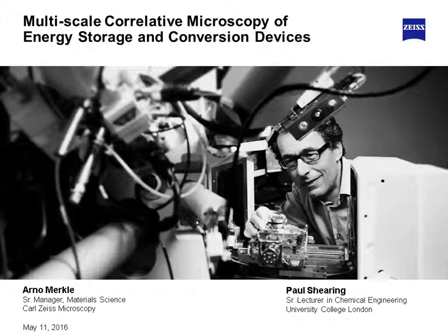Well, we developed steps for encapsulation of air-sensitive materials, both for the Versa, and I showed an image there of an operating in-situ cell we developed, which is made out of a plastic PFA part, which is very X-ray transparent. So that's great. And the sample volumes that we're interrogating in the Versa are typically quite large. So that was a nice in-situ environment that we were able to look at operating materials.